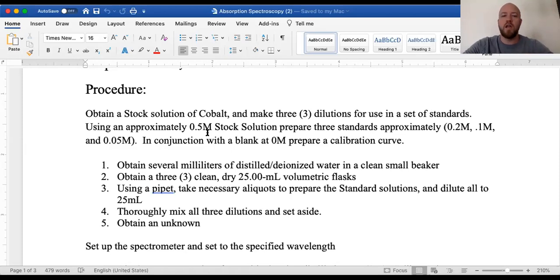Think of it as if you're making Kool-Aid. You take one scoop of Kool-Aid and put it in your glass and stir it up, it might just be kind of colored water. If I take 2 and 3 and 4 scoops, it'll get sweeter and sweeter. The super sweet Kool-Aid is what we would call a concentrated solution. Oftentimes stock solutions are purchased in high concentrations, something like a bottle of vodka. It is a high concentration that you then dilute down. That's usually what a stock solution is. So we're starting from a higher concentration and then we are making dilutions.